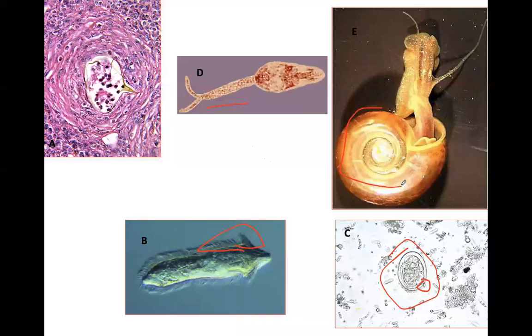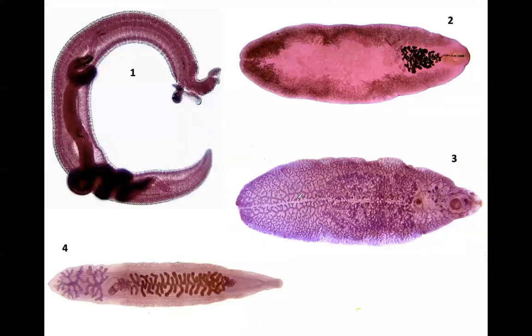Biomphalaria glabrata, transmitting S. mansoni. Right. Great. So now, going on, what is number one?